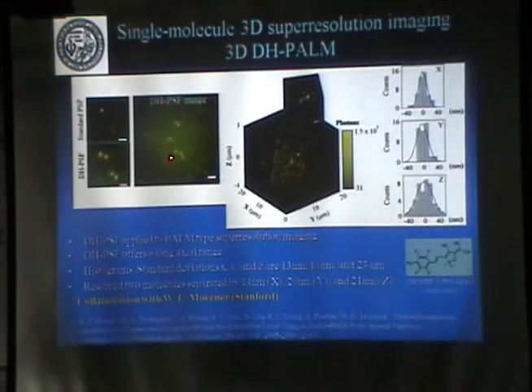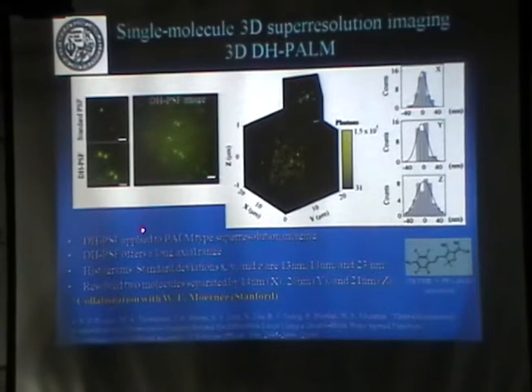This was the first experiment we did. It's fluorescent molecules inside PMMA. These are the 2 molecules, they look standard. And this shows the location of molecules inside, these are random locations inside the PMMA. And we found an example where 2 were very close. They were separated 14 nanometers in X, 26 in Y, and 21 in Z. Okay, so we have very close, 1 order of magnitude closer than the diffraction limit, but we can tell they are different. So that's resolution.